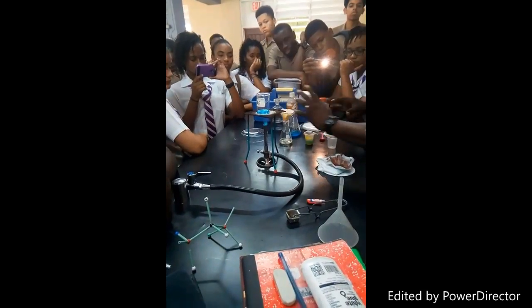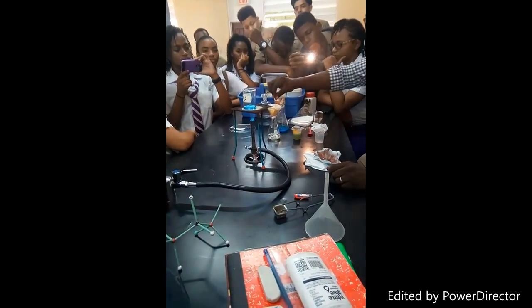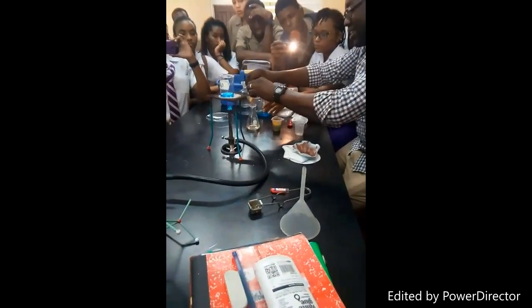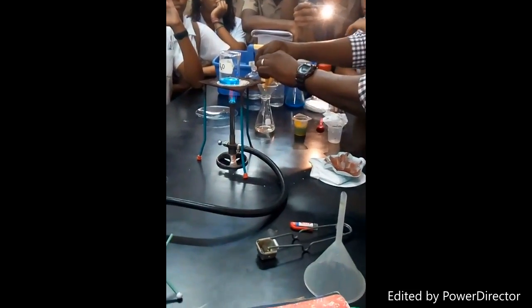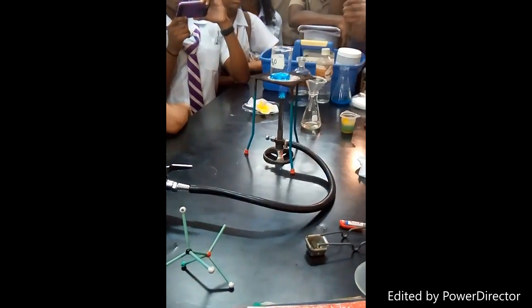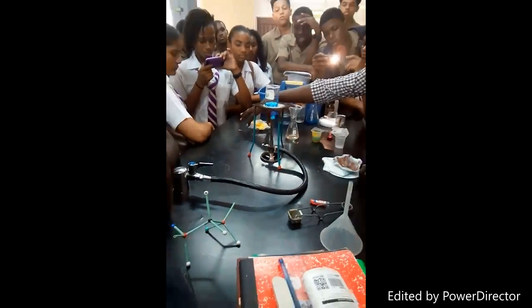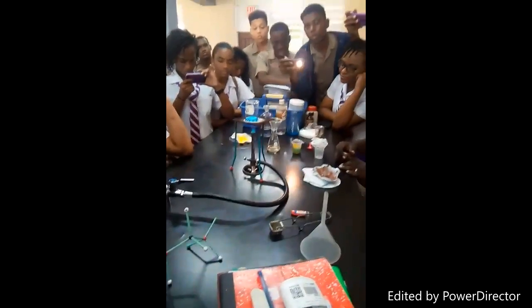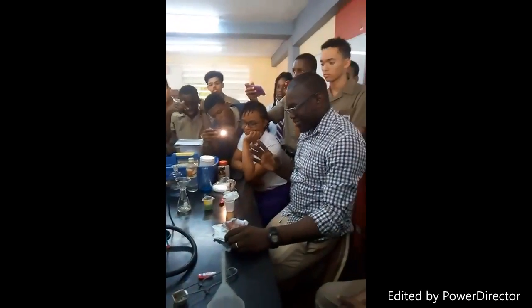Now I've finished making, back over to the insoluble salt now. I've finished making my salt because clearly I have the salt. I take this out and put it on a wash glass. And that is my lead iodide. You guys see that? Yes, sir. And I leave it to dry. And I'm done.